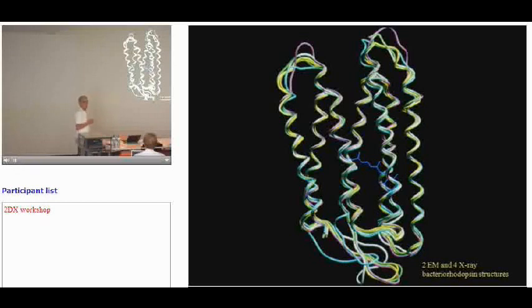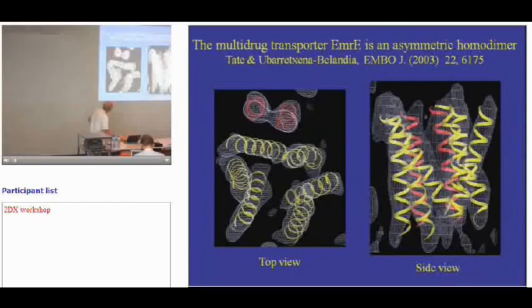Of course, they've been polished up and refined, so now it's actually quite useful to take the coordinates back from the X-ray, and so it's a kind of synergistic thing. And then another map is Eban's map with Chris Tate, and at the time this was published, which was 2003, it disagreed completely with the X-ray map, and it turned out the X-ray map was complete rubbish.